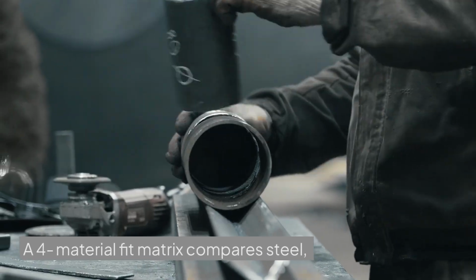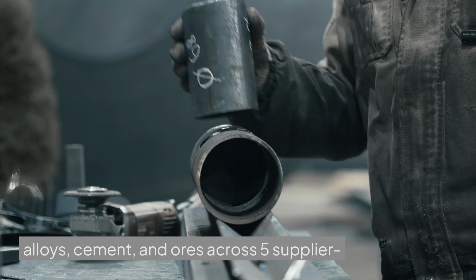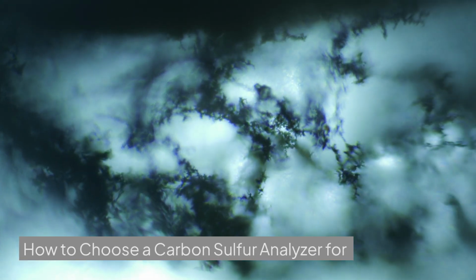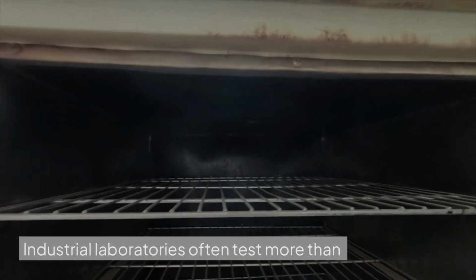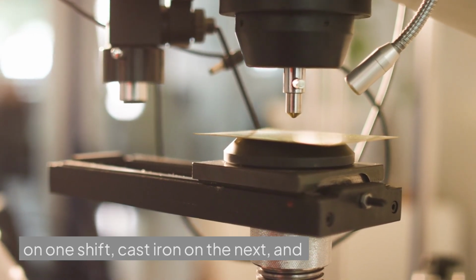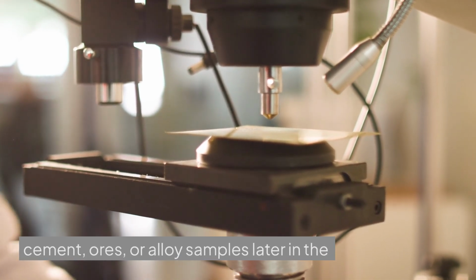A 4-material fit matrix compares steel, alloys, cement, and ores across 5 supplier selection criteria for industrial labs. How to choose a carbon-sulfur analyzer for steel, alloys, cement, and ores. Industrial laboratories often test more than one material family. A lab may measure carbon and sulfur in steel on one shift, cast iron on the next, and cement, ores, or alloy samples later in the week.